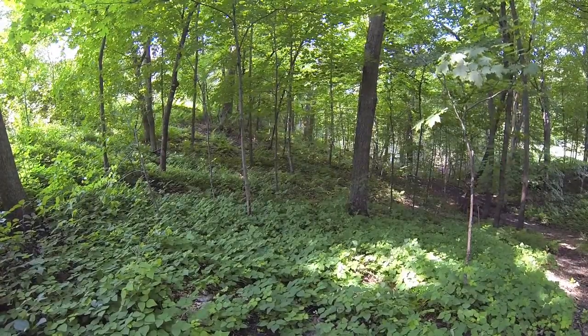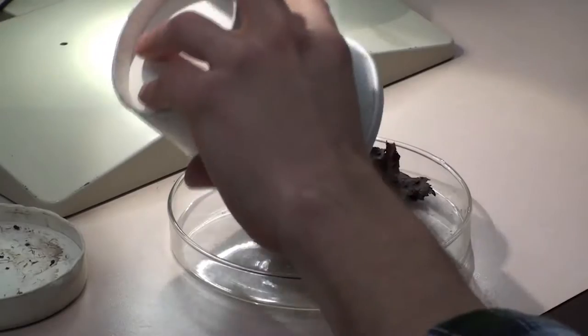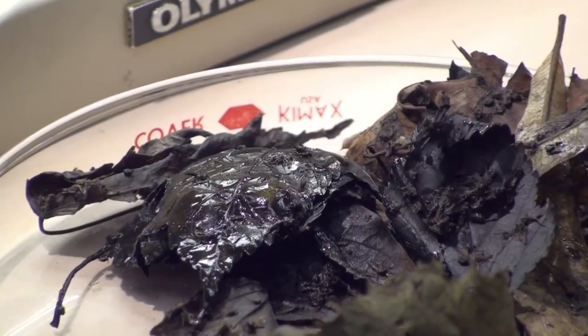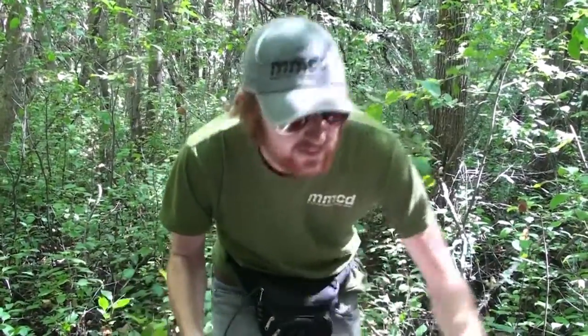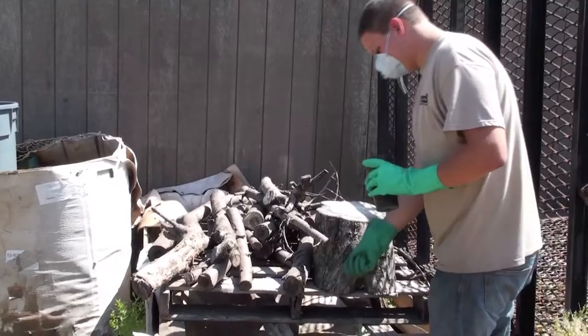It is important to be aware of environmental conditions before conducting Succ-O-Matic surveillance. Wet conditions lead to an especially poor sample. Do not collect Succ-O-Matic samples if it has recently rained or if vegetation is wet with dew. If vegetation is wet, you might need to wait a few hours before using the Succ-O-Matic, so have a plan to do something else until the vegetation is dry.